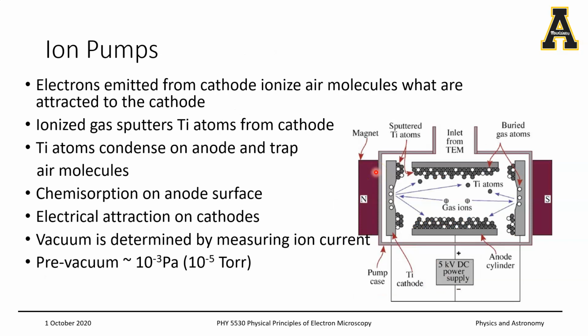Now, next we are looking at ion pumps, and these pumps are also very, very commonly used in electron microscopes, again because they are vibration-free, motion-free. There's nothing moving around here, and they work based on the Lorentz force that we have seen while we were discussing the electromagnetic lenses. So let's take a look at the general assembly of an ion pump.